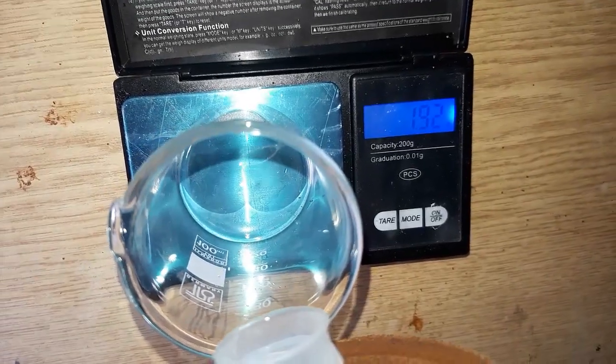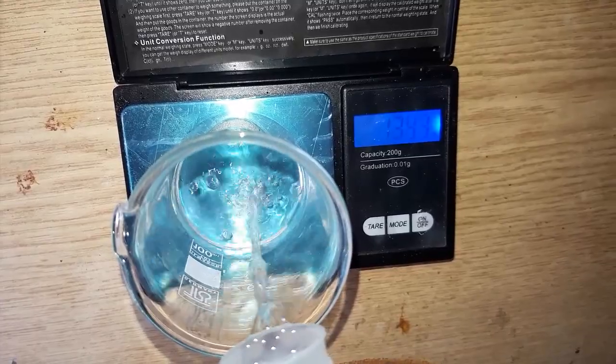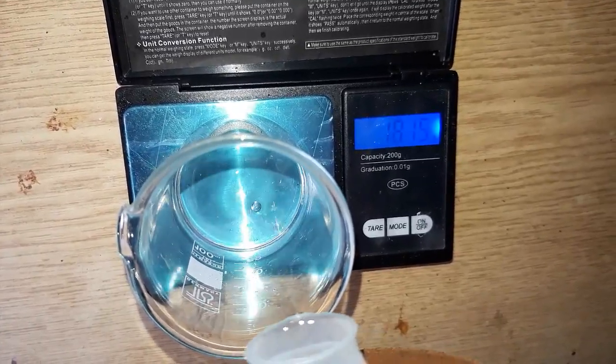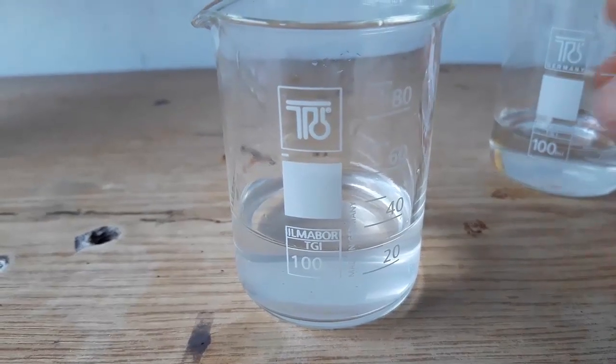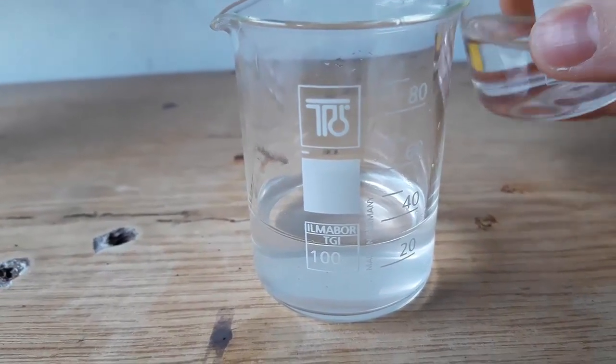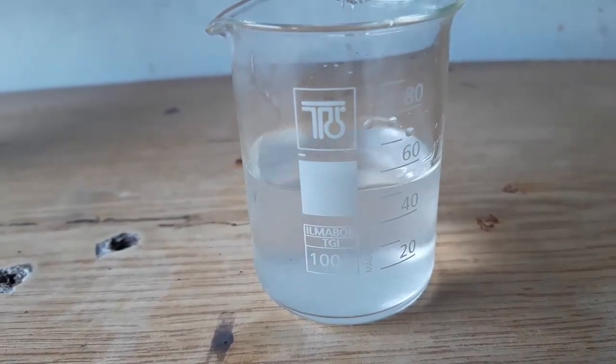Next, measure out 19 grams of 96% ethanol and add it to our sodium hydroxide solution. We'll get an approximately 50-50 mix of a basic ethanol solution.